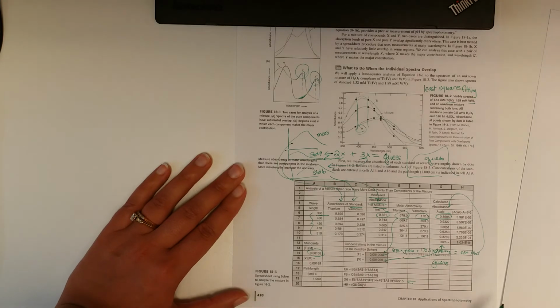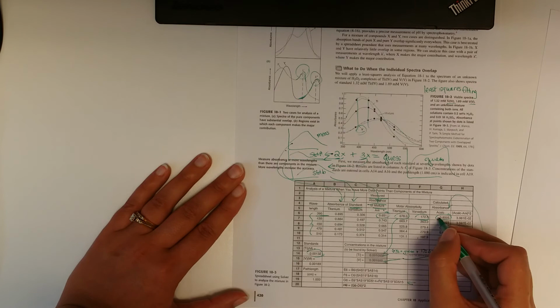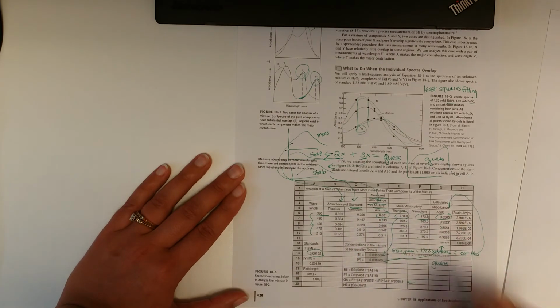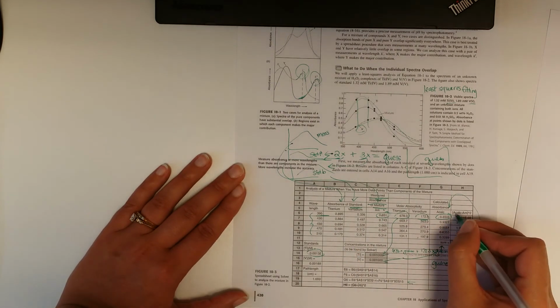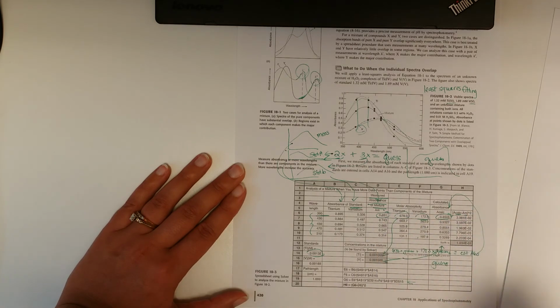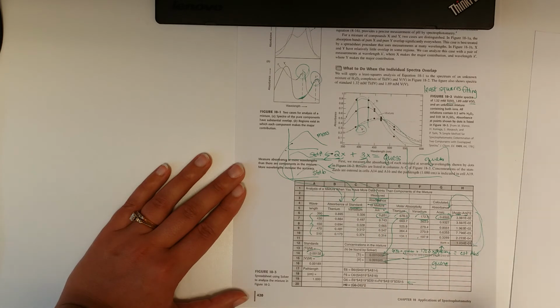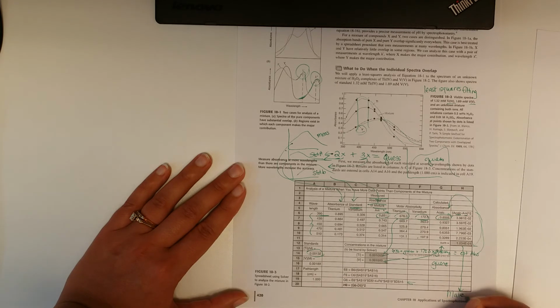Not the same, right? So we say, well, to get a really good fit, I'm going to take the difference between here and here, and I'm going to square it. So absorbance calculated, that's this, minus absorbance measured, that's that, squared. So this is where we get least squares fitting. Square the differences between your guess and your actual measurement of the mixture. Then add up all the squares, and we want to make this number as small as possible. So make the residual small.